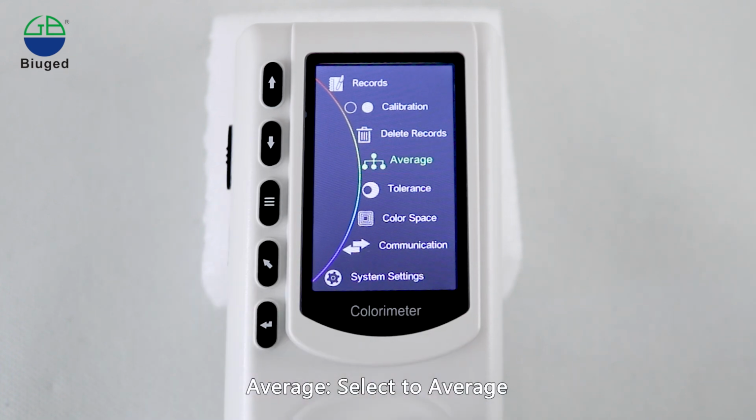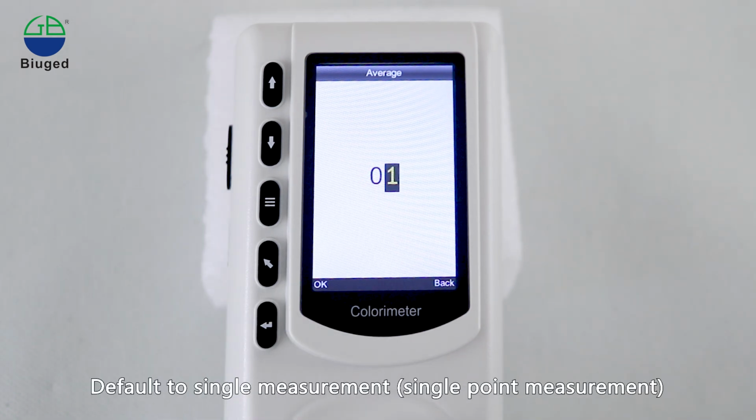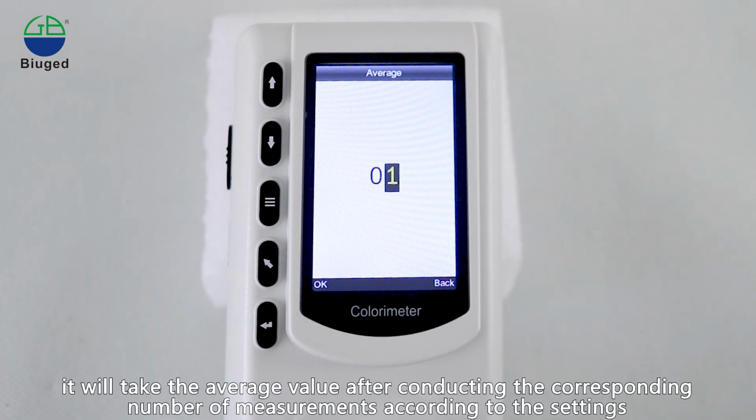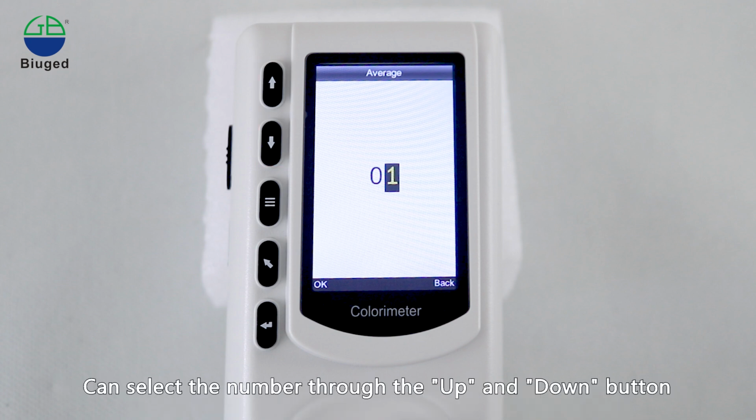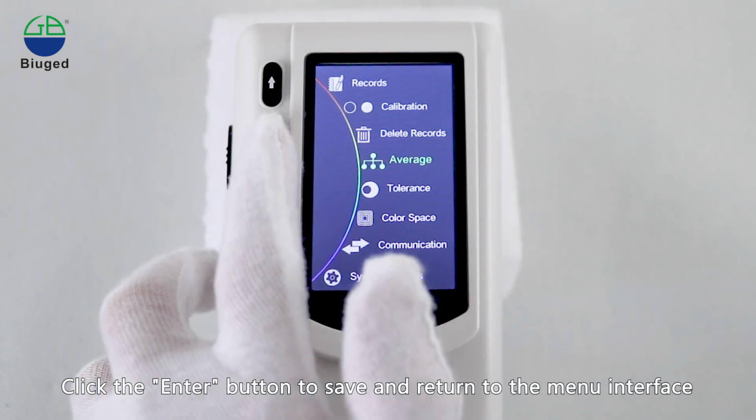Average, select Average. Click the Enter button to go into the Average interface. It defaults to single measurement. It will take the average value after conducting the corresponding number of measurements according to the settings. You can select the number through the up and down buttons. Click the Enter button to save and return to the menu interface.